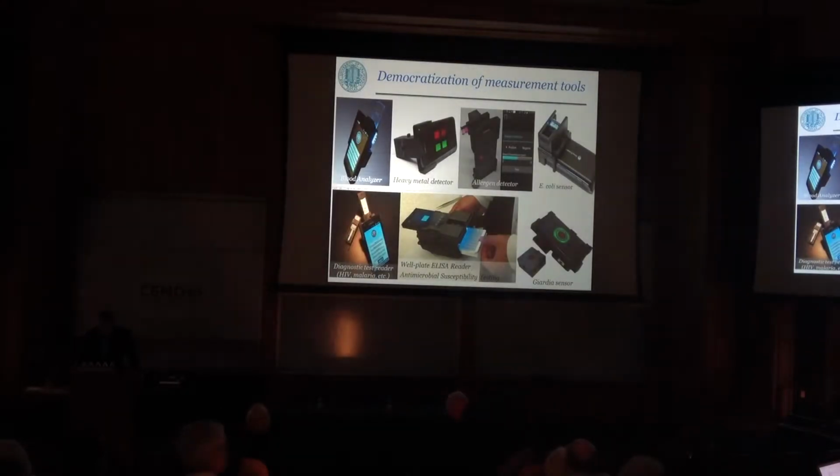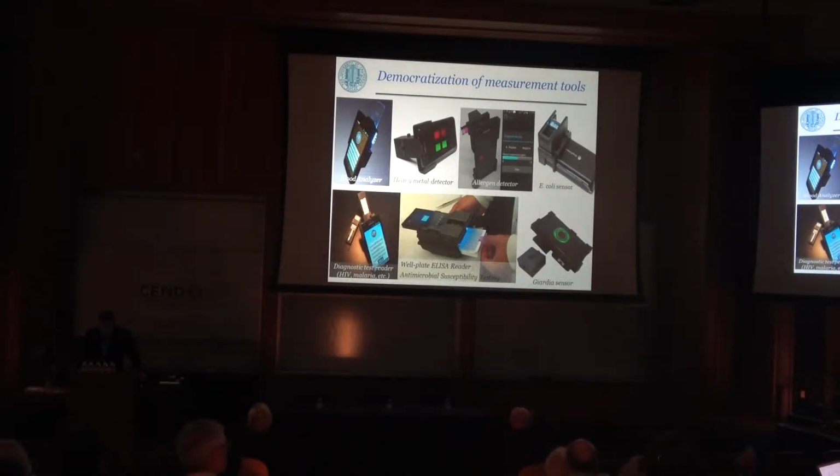So as I mentioned, it's really a long way since we started to play with smartphones for microscopy and sensing. In addition to microscopy, we're also very much interested in using the smartphone as a sensor of various different kinds. In some earlier work, we've used it to detect waterborne pathogens.